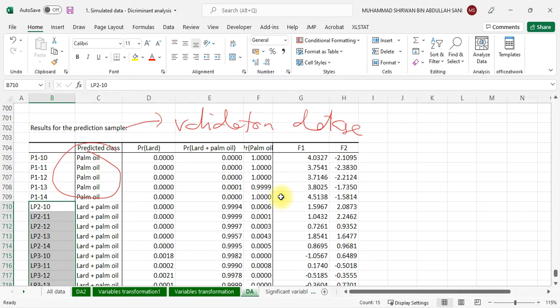So this is the challenge for everybody going for halal. Unfortunately, for oil samples, people will go for halal testing using PCR, polymerase chain reaction, a DNA test. Unfortunately, in oil samples, it's very hard to extract DNA. So that's why people go to fatty acids. But that's also another challenge.